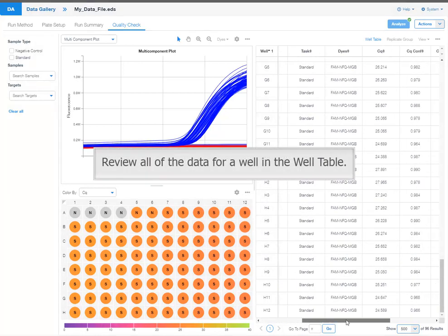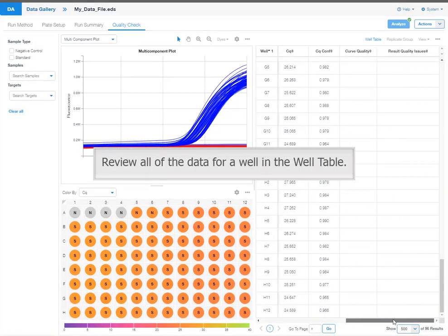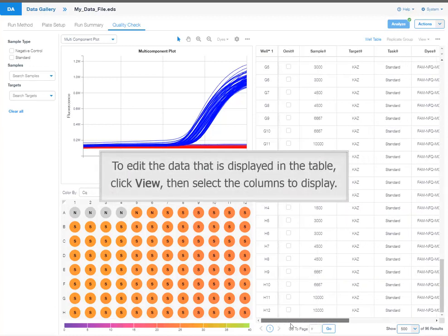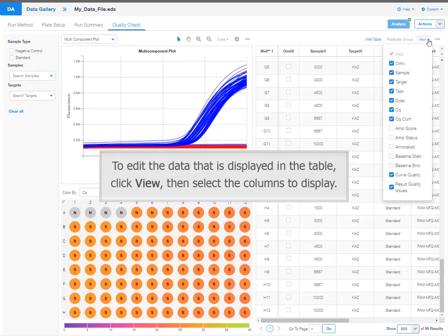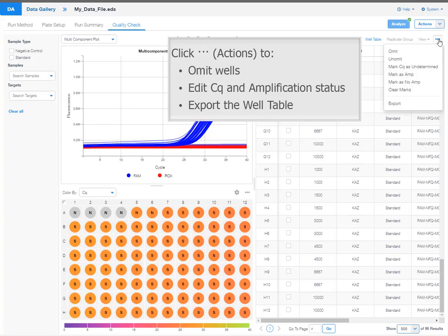Review all of the data for a well in the well table. To edit the data that is displayed in the table, click view, then select the columns to display. Click the actions icon to omit wells, edit CQ and amplification status, or export the well table.